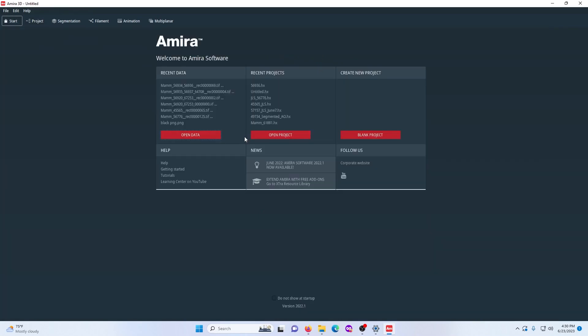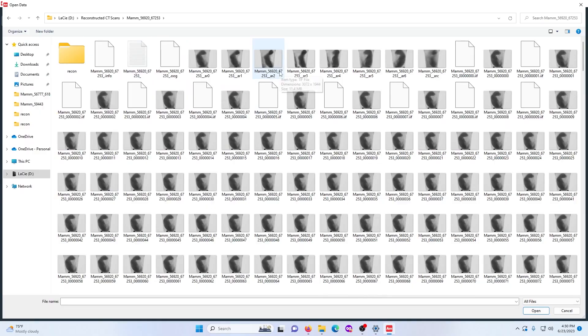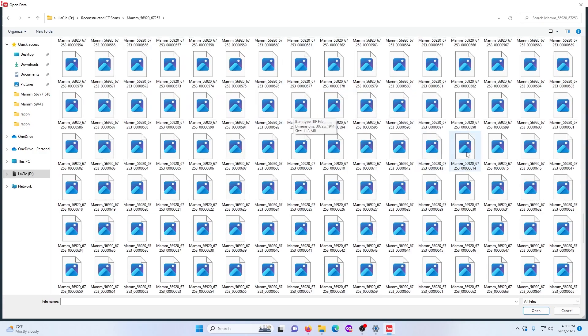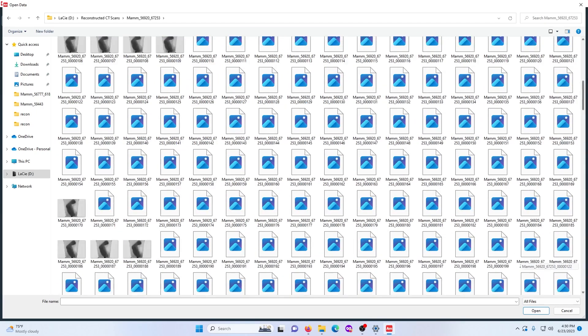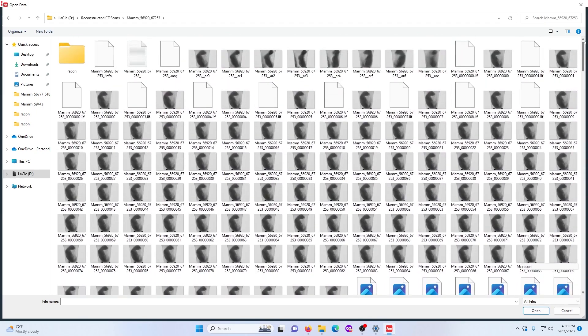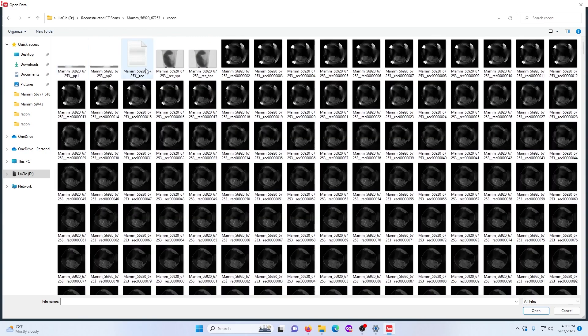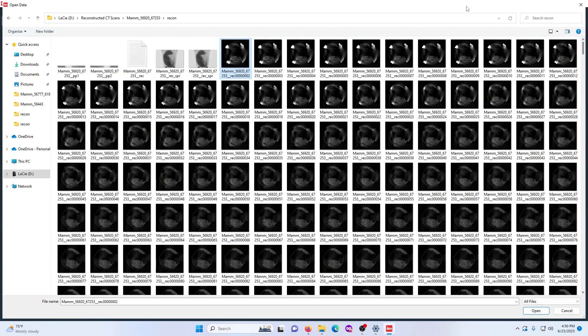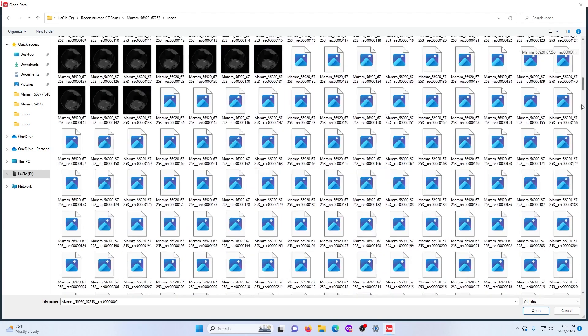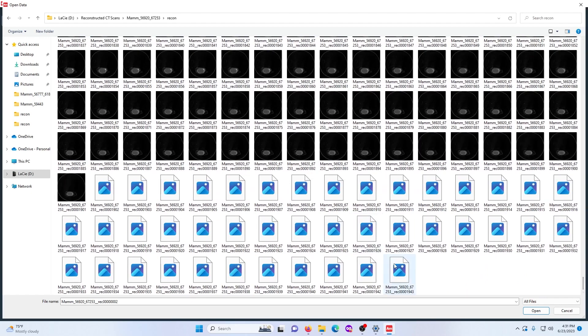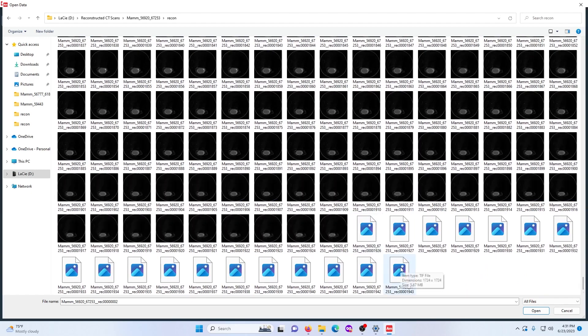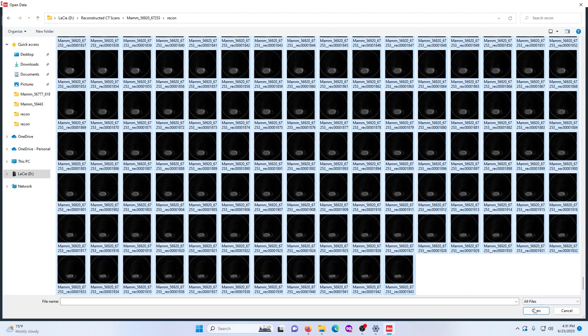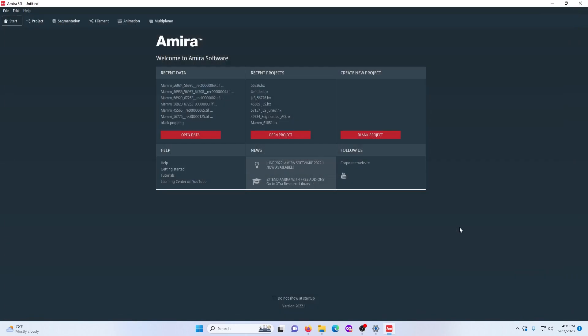The first thing you have to do when segmenting a CT scan is actually open the data. So here's the output of a CT scan. This is basically what you get, at least for the machine that I use, which is a mini CT scanner. You want to make sure that you use the reconstructed version of the CT scan. You want to select the first black picture and then all the way down to the very bottom. Hold shift and then click on this one and that'll select all of them and then you just open it and it'll convert this to a 3D model that you can then segment.